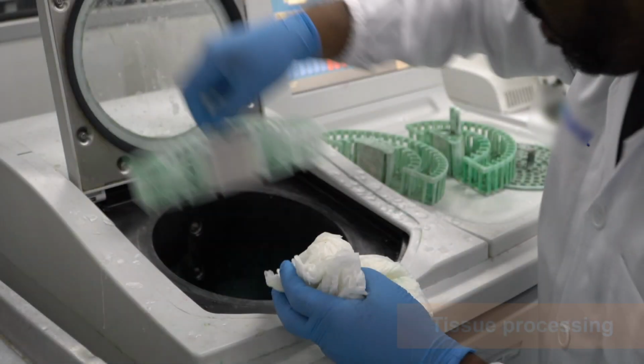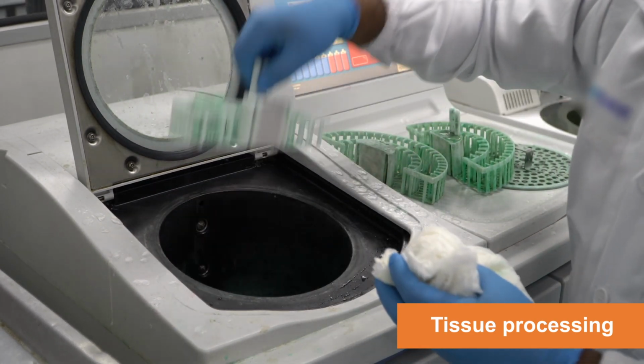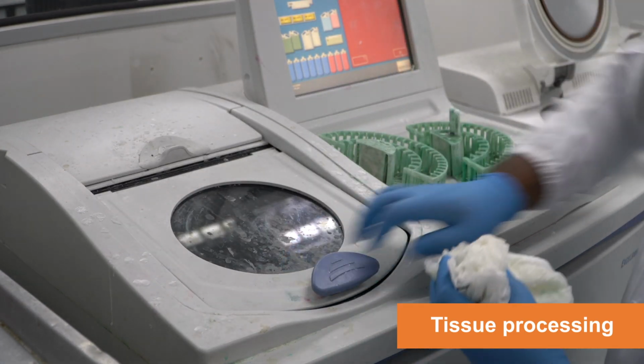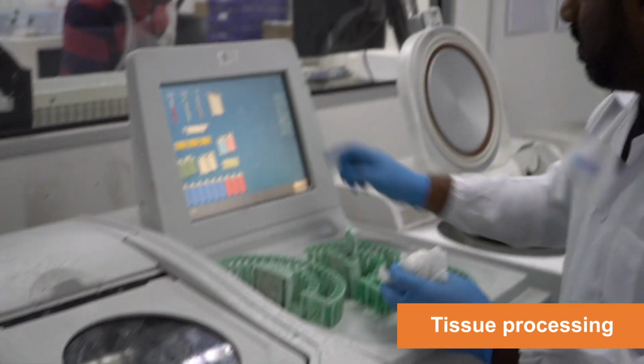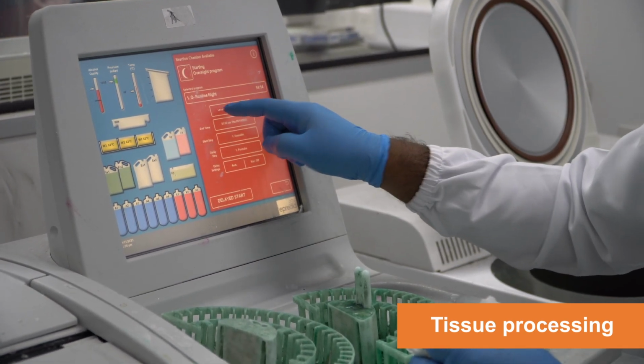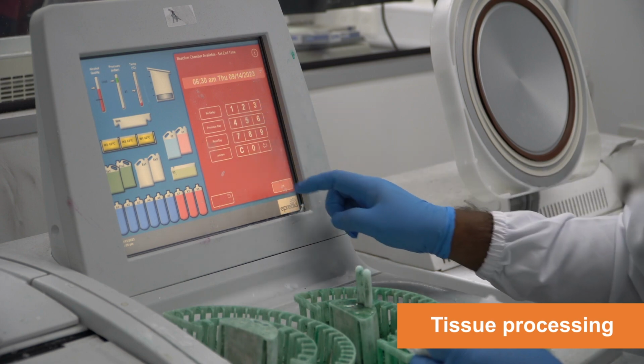Tissue processing involves dehydration, clearing, and infiltration, taking tissue from fixation to embedding for section cutting. It can be done manually or automatically using machines like automatic tissue processors. These machines offer efficiency and convenience, moving tissues through chemical agents on a preset timescale.